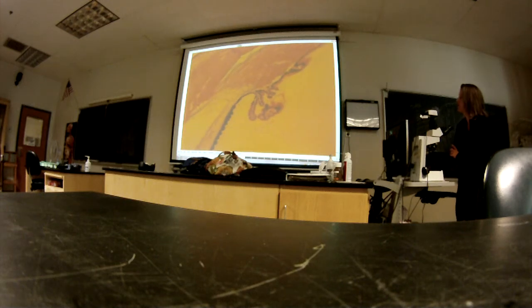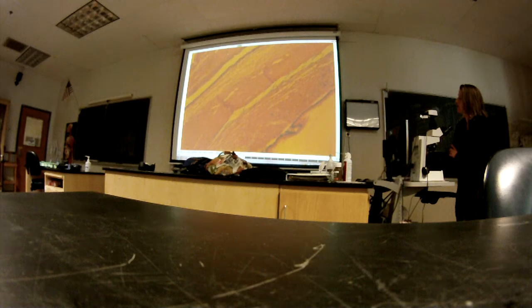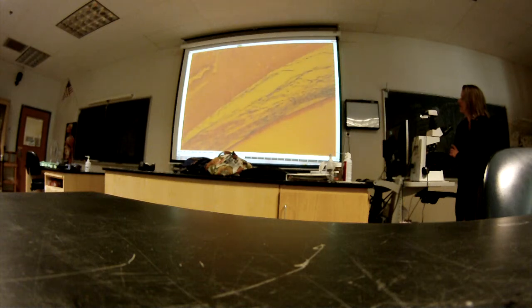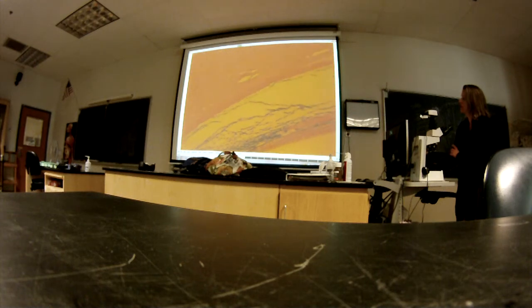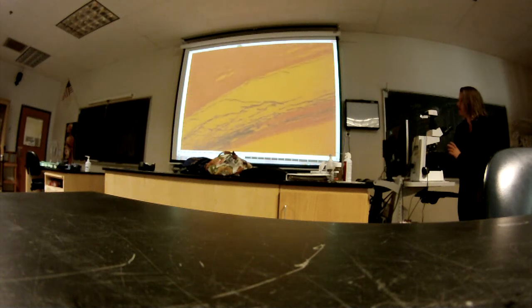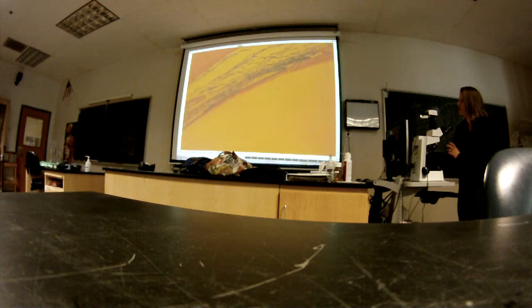That can be a little tricky to remember. If you look at it like this, you can see it's a continuation, really, of the choroid. Remember, vascular tunic is choroid, ciliary body, and iris. So the answer was vascular tunic. So this is the choroid. It's just a little sparse right here. It's kind of spread out a little bit, but it's got a lot of pigmentation. Dark. You follow it this way.